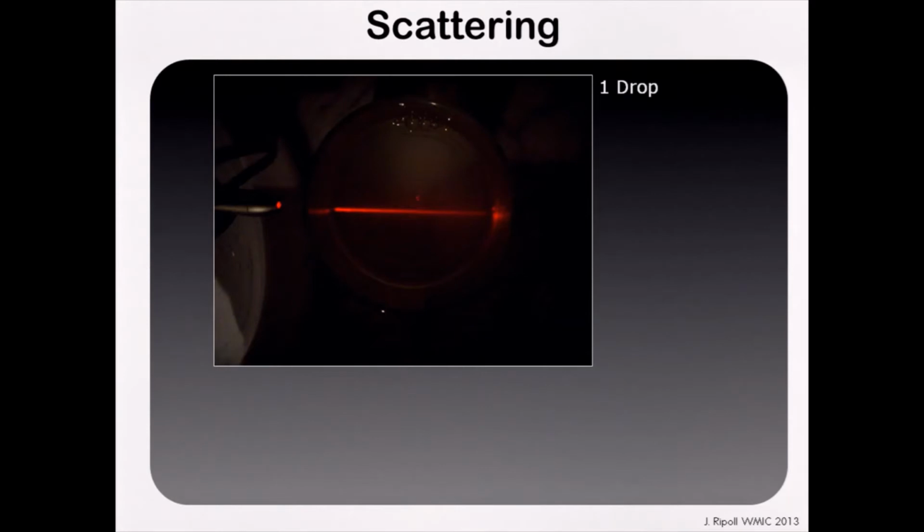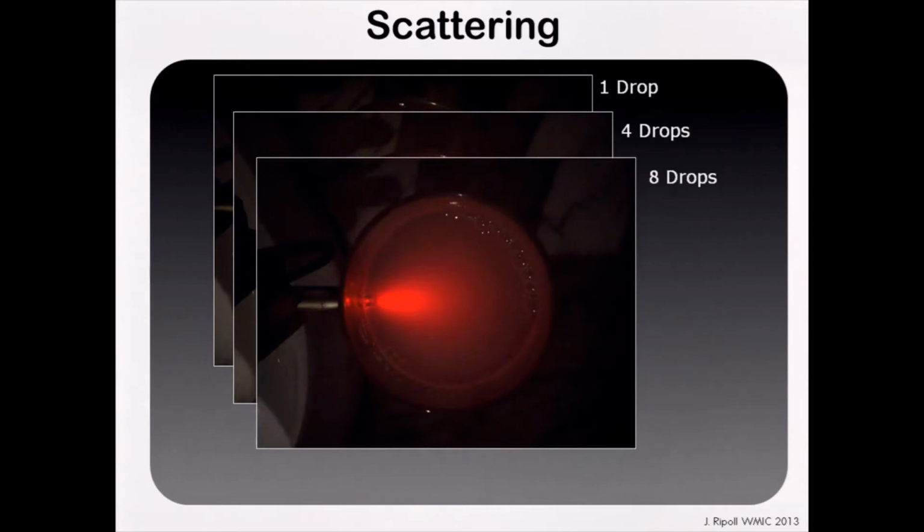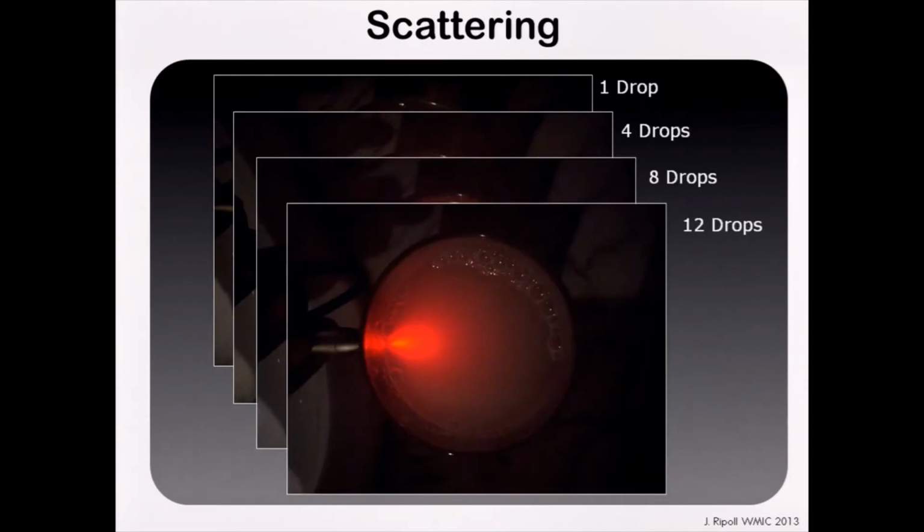This is what happens in microscopy. This means that we can still maintain spatial information when we image, because it's not lost on propagation. Now, the more scattering I put there, the more drops of fat I have there, the more I start losing this original direction, and at the end I end up with this type of image, where the original direction is completely lost. It looks like an isotropic point source at this point, and in this case we say that light diffuses inside the medium.